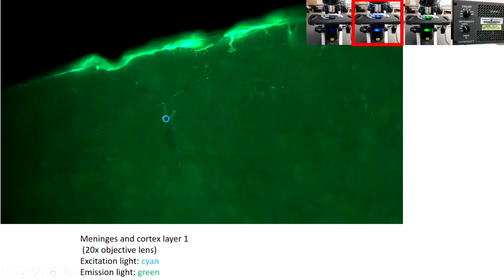Let's go to astrocyte. So this is the astrocyte stain, the GFAP stain. You can find some GFAP stain in the first layer, which means there are some astrocytes in the first layer. But the deeper you go, the less astrocyte you can find, right? And then in the meninge layer, you can see a very bright staining. Are they astrocytes? The answer is no. But why do they light up? Because there are some other cells in the meninge that also contain GFAP.